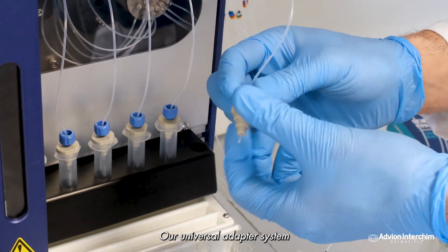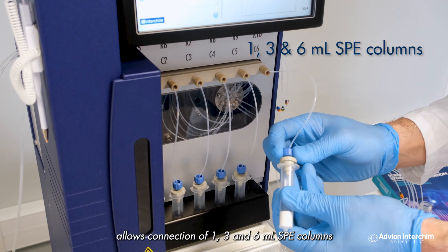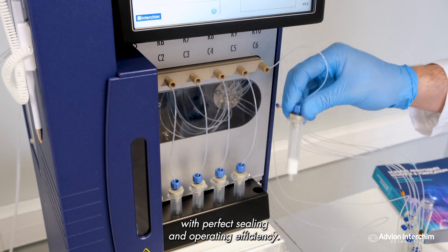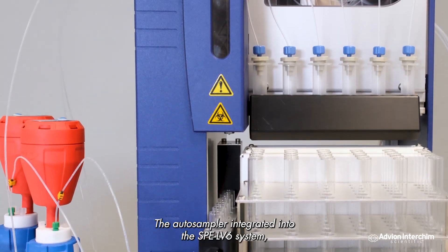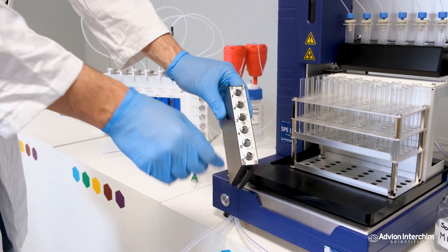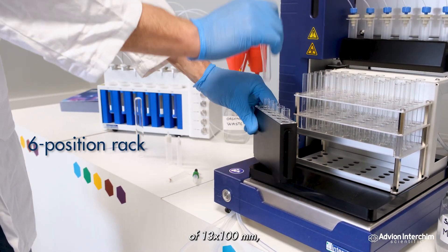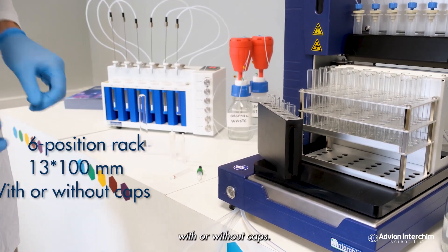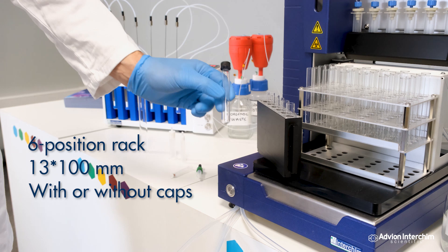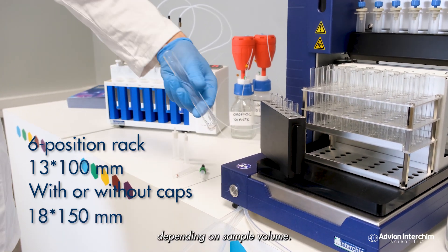Our universal adapter system allows connection of 1, 3, and 6 milliliter SPE columns with perfect sealing and operating efficiency. The autosampler integrated into the SPE LV6 system uses a 6-position rack for tube sizes of 13 × 100 millimetres with or without caps, or 18 × 150 millimetres depending on sample volume.